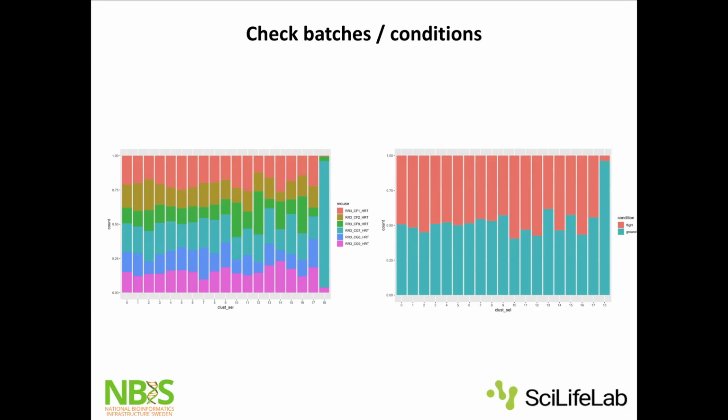Oh, I can't give one straight answer to that. I mean, it clearly depends. If that sample happens to have a bit like this cell type, for instance, let's say that you have these biopsies that you are studying, and then you happen to have one biopsy that also got a bit of another tissue type into the biopsy. So that one sample will have a different cell type. Then I would exclude that cluster and motivate why I'm doing it in my method section of the paper.